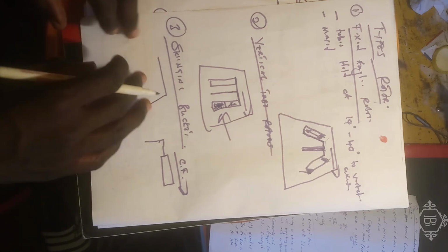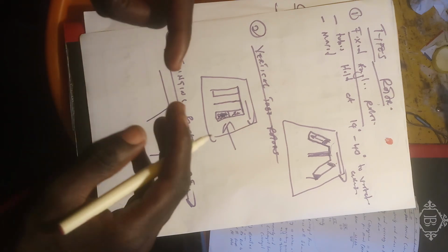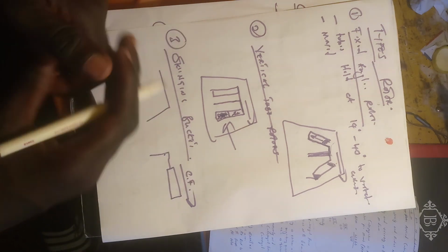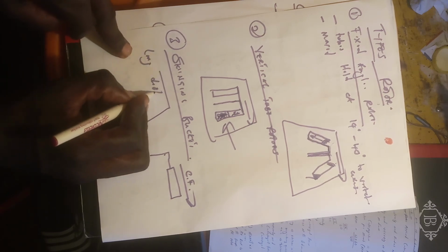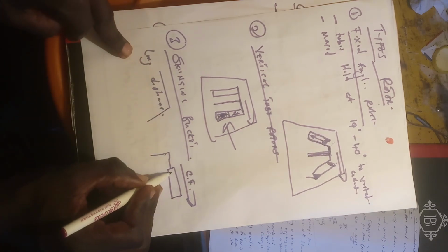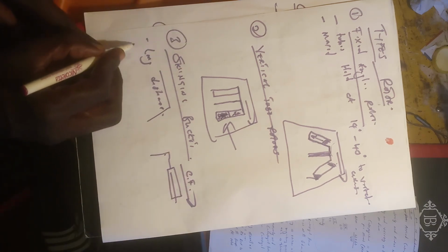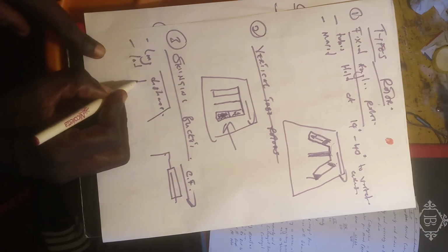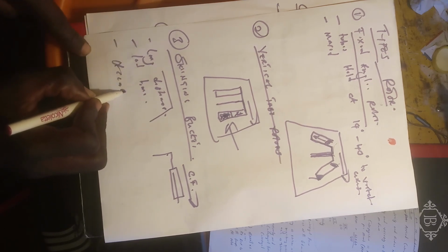In this type of setup, there is accuracy in separation. Why? Because particles move a long distance, and it takes a lot of time. So there is accuracy.